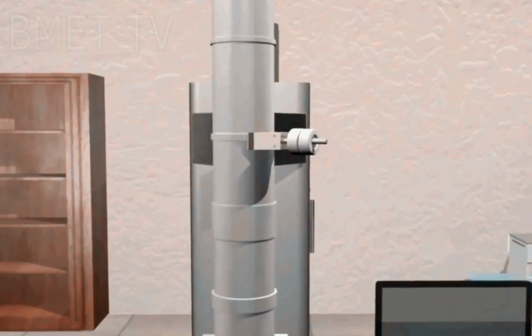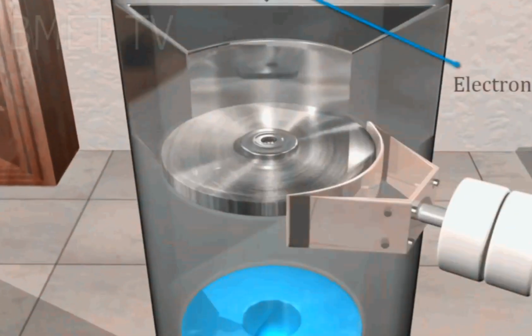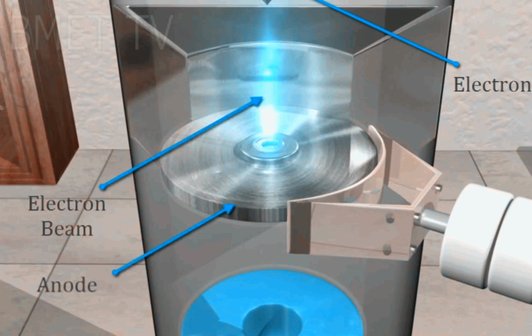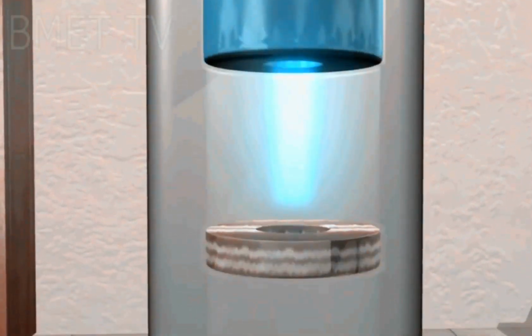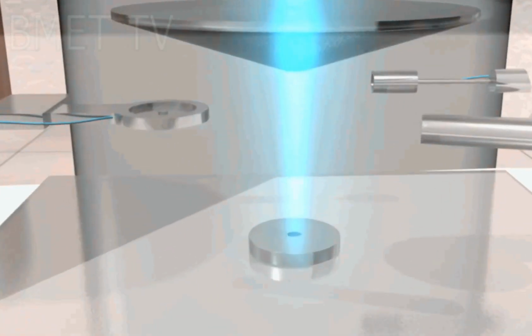The third type of microscope is the electron microscope. Electron microscopy, or EM, is a technique for obtaining high-resolution images of specimens. It is used in the evaluation of pathology cases for detailed examination of structure of tissues, cells, viruses, organelles, and macromolecular complexes. The high resolution of EM images results from using a beam of accelerated electrons as the source of illuminating radiation. These images provide key information on the structural basis of cell function and of cell disease.